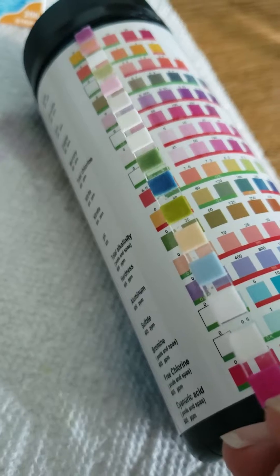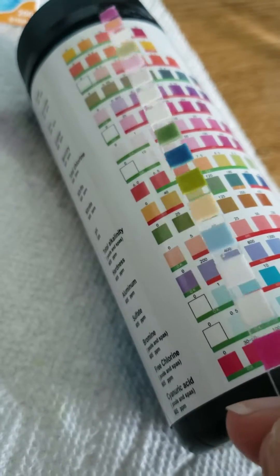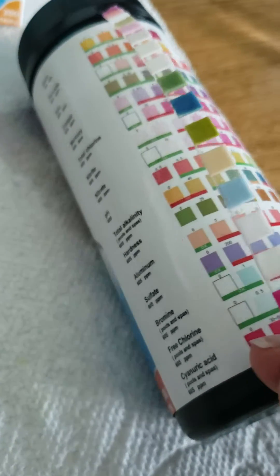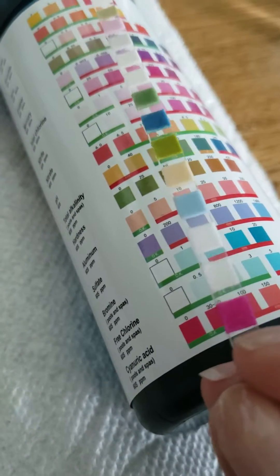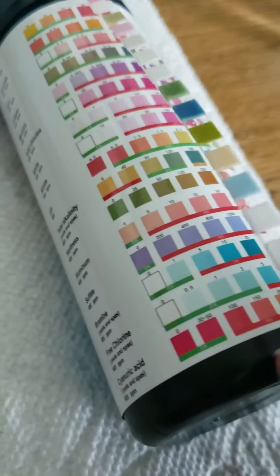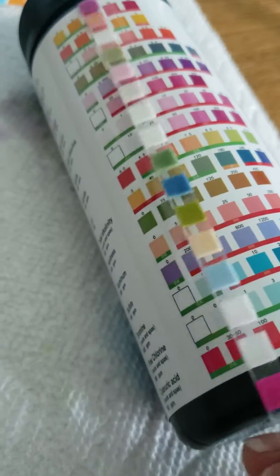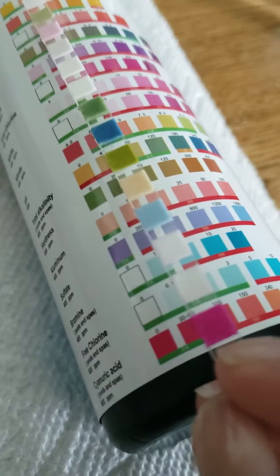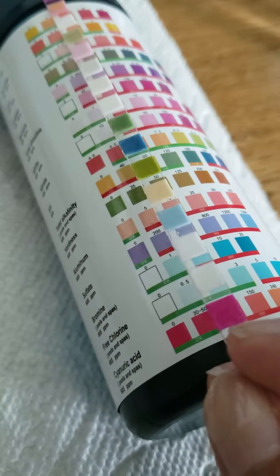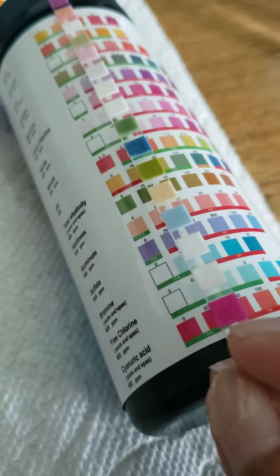Bromine is negative. Free chlorine is negative. And then cyanuric acid — looks like it's 30 to 50.